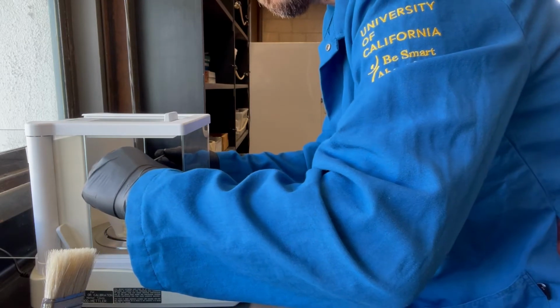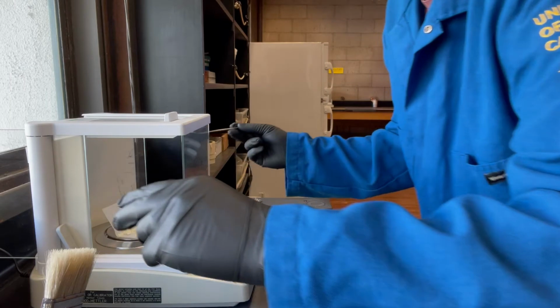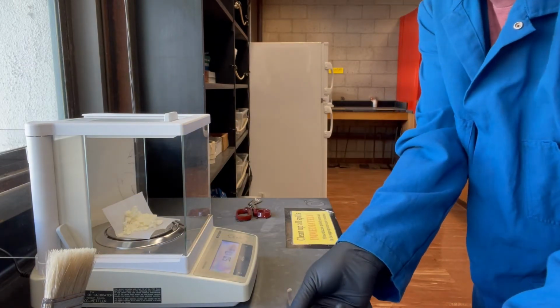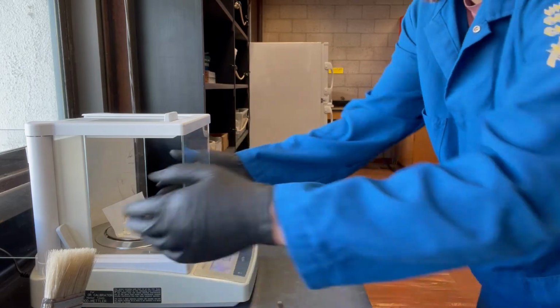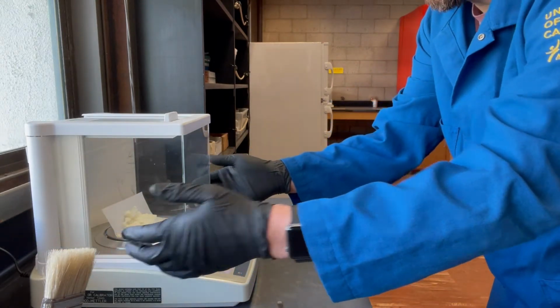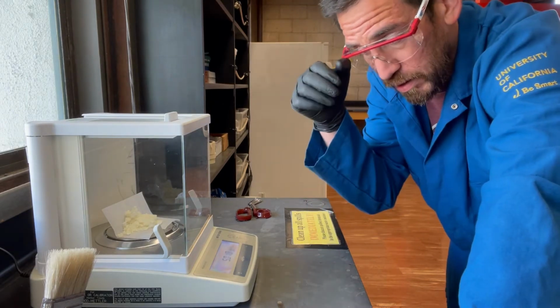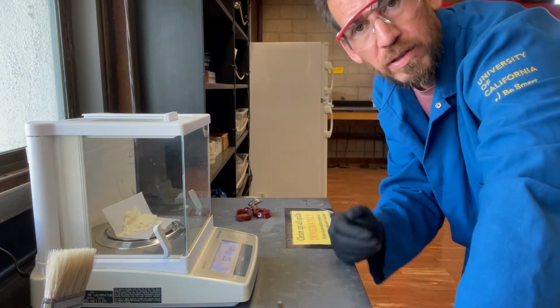Cool. We have 5.017 grams. Okay. I'll go ahead and close this just to make sure it doesn't change, but it should be good. 5.01. I'm hitting the bench top, so it's messing it up a little bit.